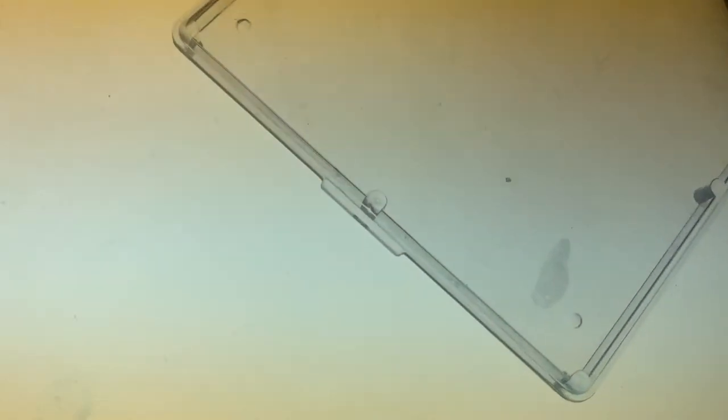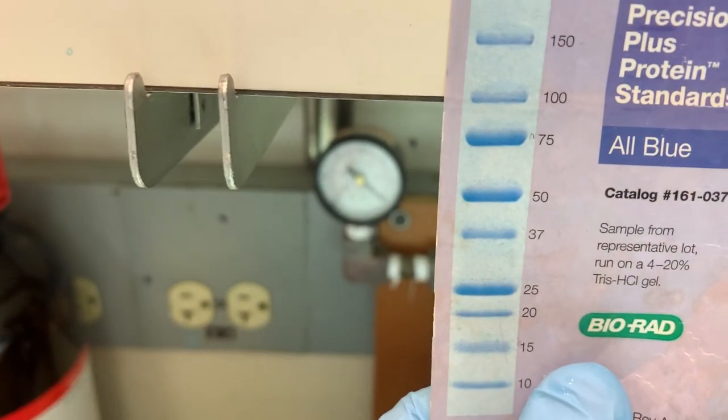Now let's turn on the light box and look at the results. You can see that one lane clearly had way less protein because I can barely see the band. The first lane is pre-purification and here's at the end. You can see that the pre-purification lane has like a bunch of different protein bands — it's less pure. In the later lane, you still have a little contaminating protein, but compared to the main protein band it's a lot less. My protein was between the 75 kDa and 100 kDa ladder bands, which is perfect because my protein is about 97 kDa.